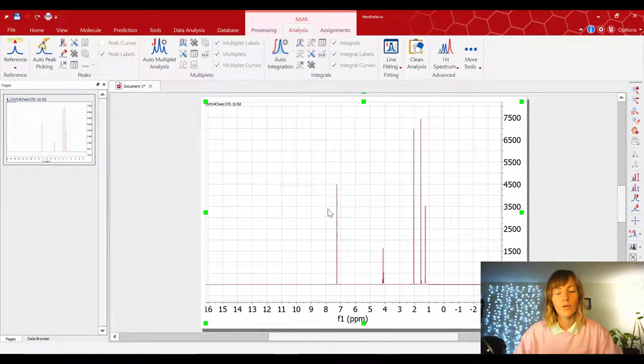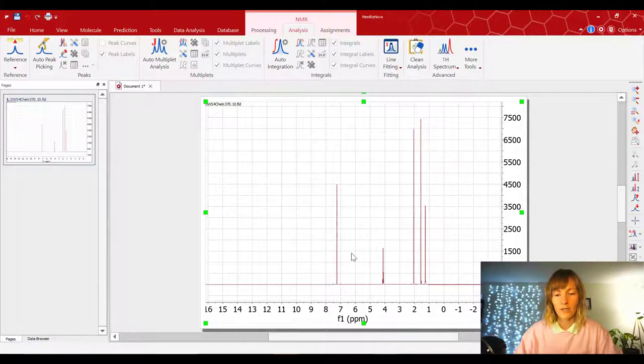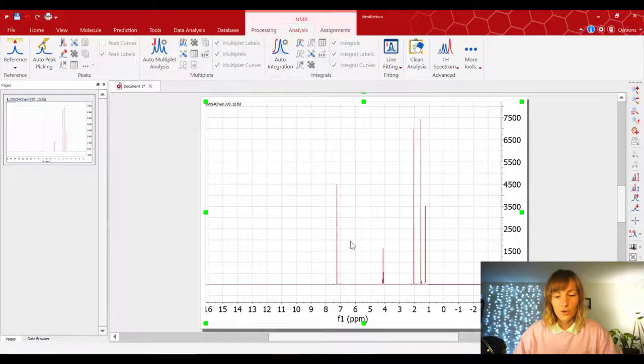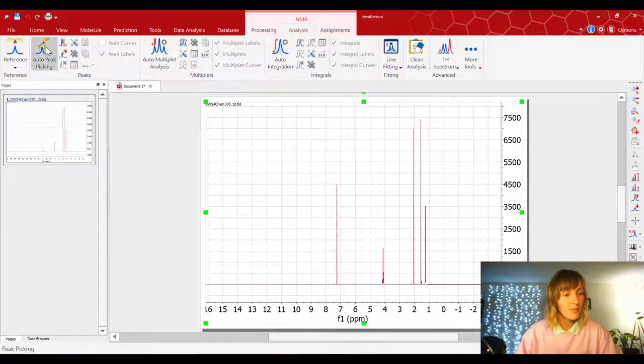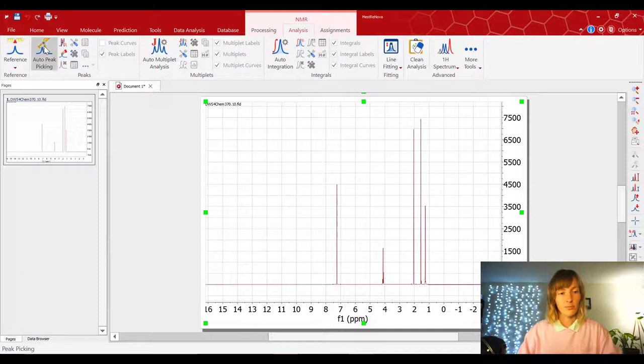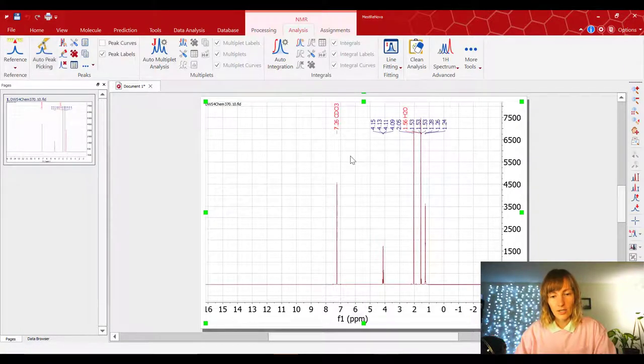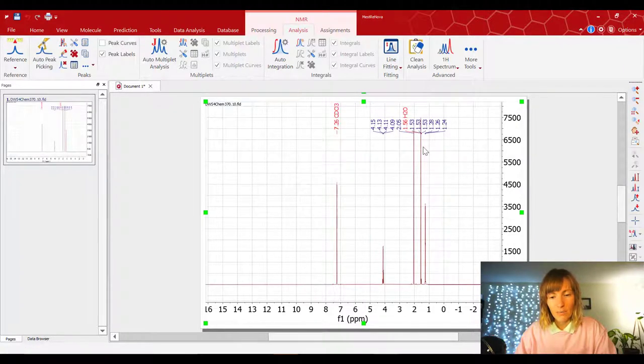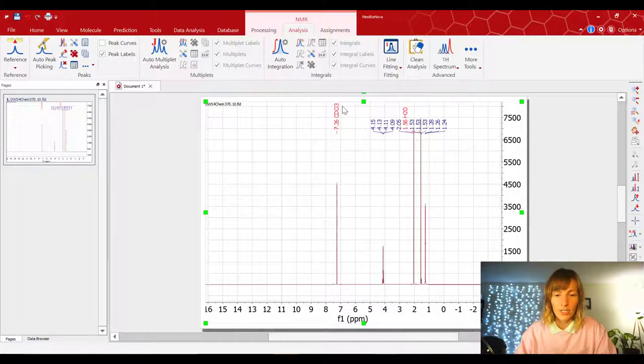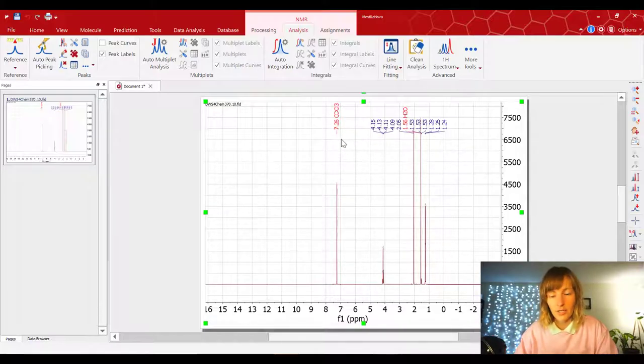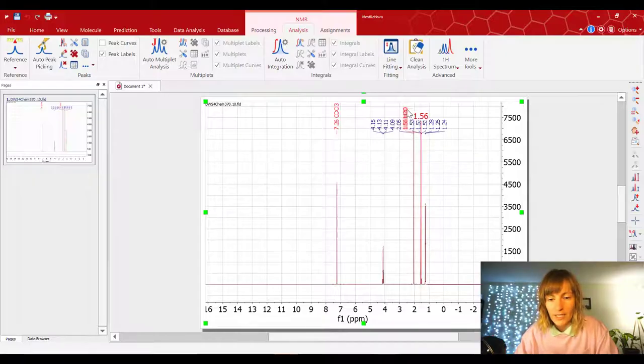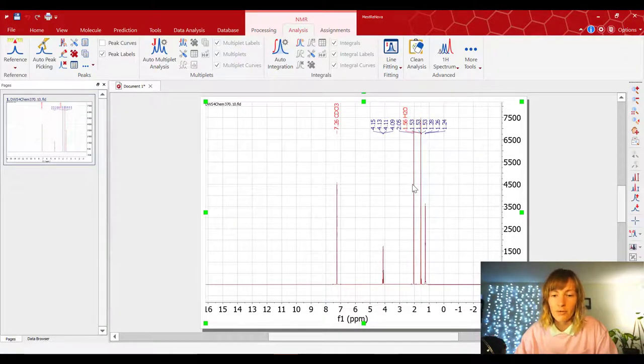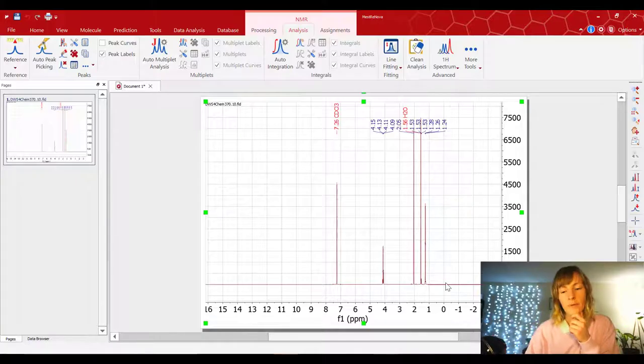Alright, so next, we have to pick the peaks. So we have to find where are these peaks located? What are their chemical shift values? So to do that, we are going to go over to the auto peak picking button, and press on it. And notice that it picks all the peaks, and it also found some of these solvent impurities. So it found the CDCl3, and it colored it red. And it also found a little bit of water at 1.56, and it colored that peak red as well. So that's kind of a nice feature about this MNOVA software.